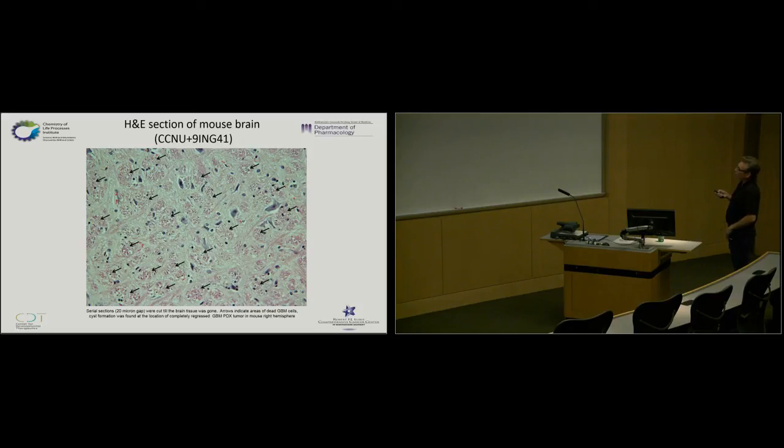And depending when you stop the model, sometimes you see these little, I call them vacuoles, but I'm not sure that's the right description for them. But you can see what the tumor used to be, where it's no longer there. But if you actually let the treatment go longer, these also disappear. So there's some promotion of regeneration of the neural tissue in the area where the tumor used to be in the combination treatment group.